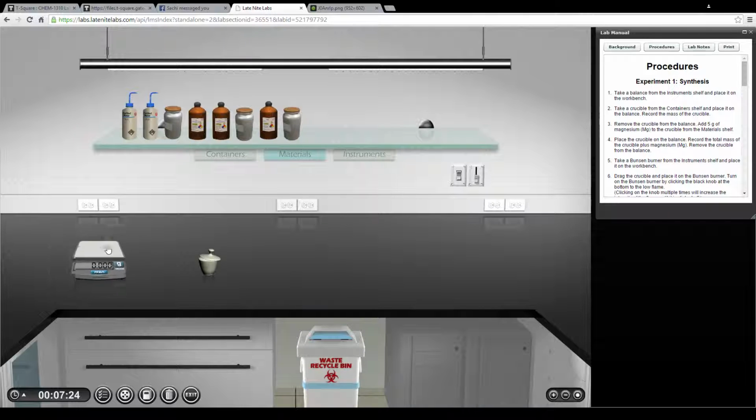Okay, so now that we're finished with the burner, we're going to measure the crucible yet again. Remember that the mass was previously 93 grams, but is now increased to 96.289 grams, meaning that the magnesium has bonded with oxygen, and the magnesium oxide that has resulted is a little over 3 grams heavier than what it was previously.